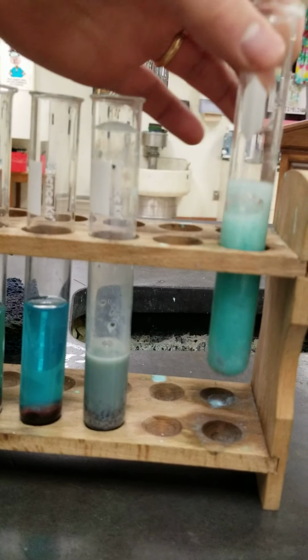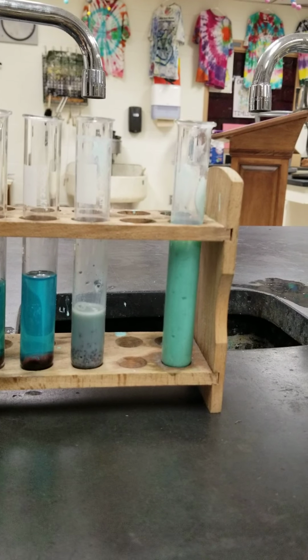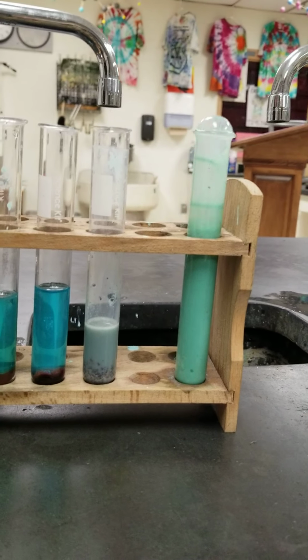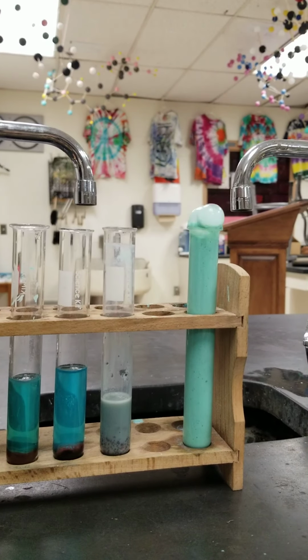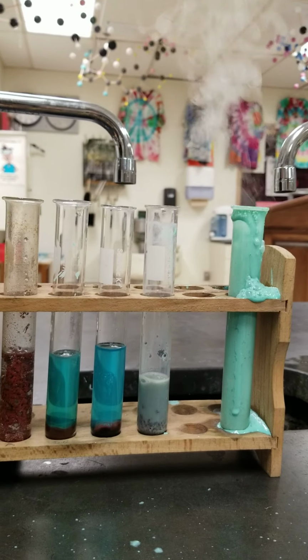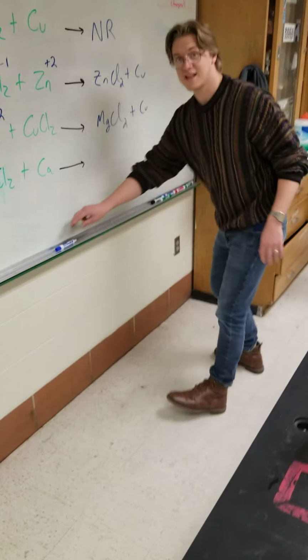It's starting to get warm. I'm going to set it down and move it closer to the sink. That one's reacting a lot more than the magnesium was, even to the point where it's starting to bubble over and is going to make a mess. You can still see the magnesium over here still reacting as well. So, obviously that one reacts.